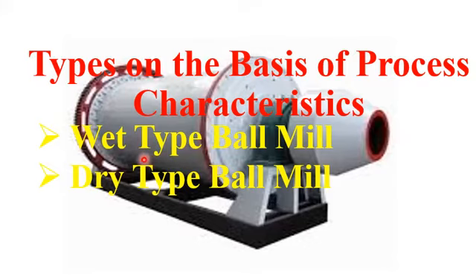So in simple words, in a wet type ball mill machine, water or, at an advanced level, different types of solvents are incorporated inside the drum of the ball mill apparatus during the crushing or feeding, and this water or solvent converts the crushed material into a slurry of different concentration. Then the slurry is further processed into a nanoparticle or nanomaterial.